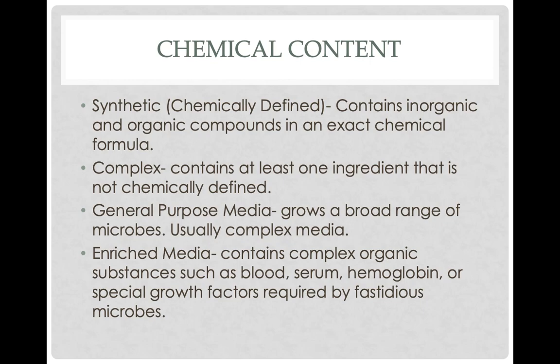Nutrient broth is kind of the same way. It's made from beef broth. Oh, I don't know what makes up a soybean. Nobody knows what makes up a soybean because every single soybean is different. Every single soybean has a slightly different content of nutrients inside of it than every other soybean out there. So you can't say for 100% fact that this agar contains this amount of stuff. You just can't do it. So those types of agars are called complex. You might know most of what's inside of it, but the soy part, the soy proteins or the beef proteins, you just don't know. So that's what's termed complex.